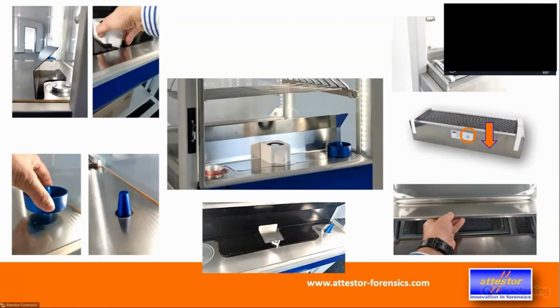Right, so this is the setup of the system just before you do your fuming. You see on the right side the distilled water for the humidification. On the left side you see a glue dish where you put your glue in. And then you simply go.